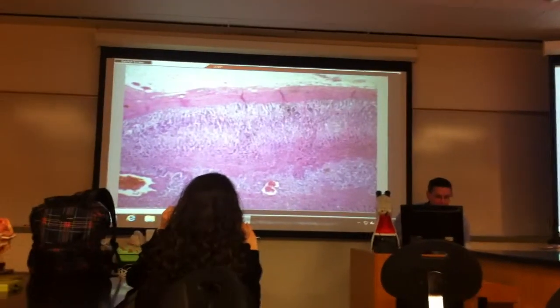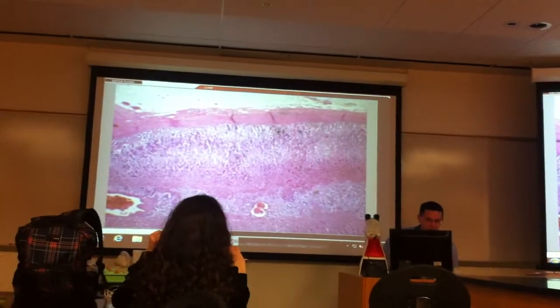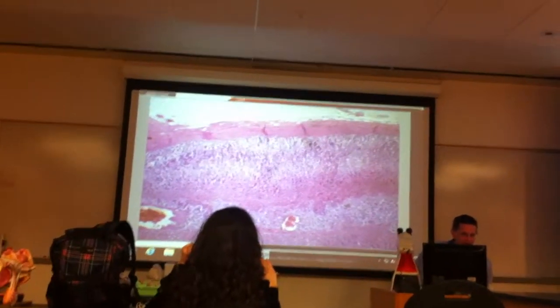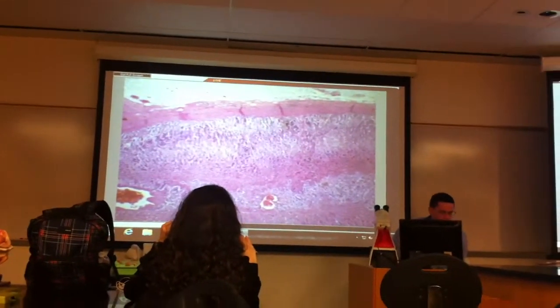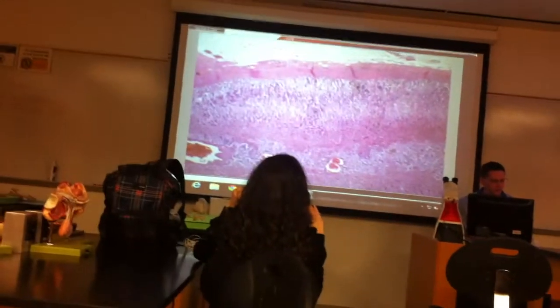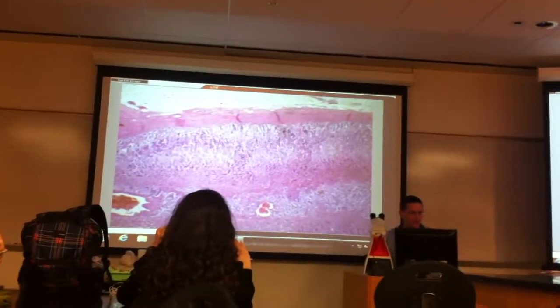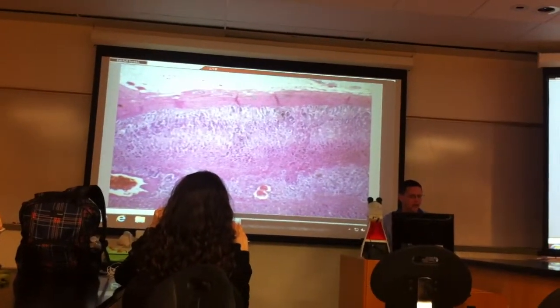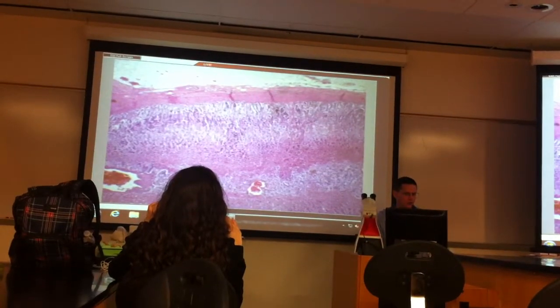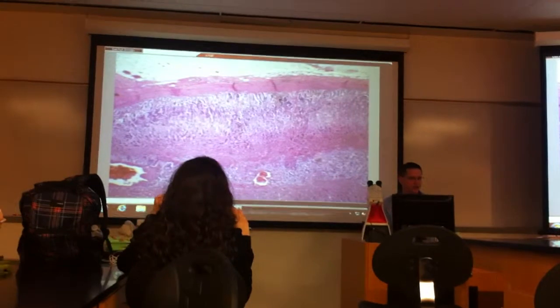The adrenal cortex is split into 3 layers. You can almost see them here. That is, right, from here to there, about as thick as the capsule, that is zona glomerulosa. So zona glomerulosa is, right, the outermost of these 3 layers. Zona glomerulosa is the part of the adrenal cortex touching the capsule. Now, it's about as thick as the capsule. That's a pretty good guesstimate there.